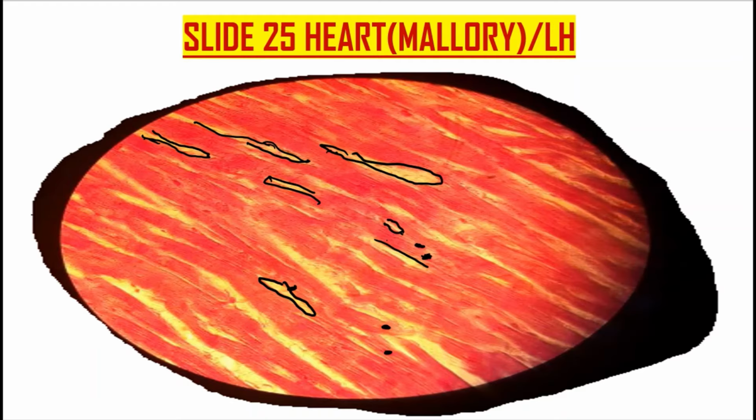It is just mononucleated, but sometimes it can have two nuclei per muscle fiber, which is binucleated. It also has striations. What are striations? You're able to see inside the muscle fibers as if they are parallel lines. So like skeletal muscle, cardiac muscle has cross striations.